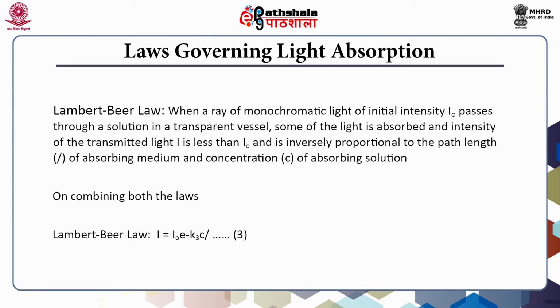On combining both the laws, Lambert-Beer law states that when a ray of monochromatic light of initial intensity I naught passes through a solution in a transparent vessel, some of the light is absorbed, so that the intensity of the transmitted light I is less than the initial intensity I naught and is inversely proportional to the path length of the absorbing medium and concentration of the absorbing solution.